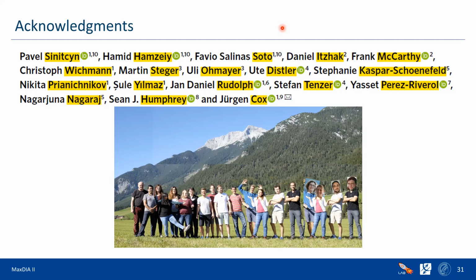So let me think. I think if you provide a library with, let's say, HLA peptides or endogenous peptidome, or even predicted, it should work pretty okay.